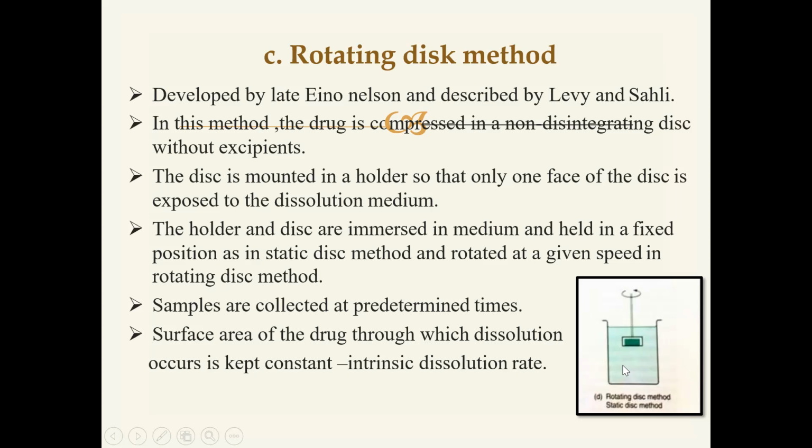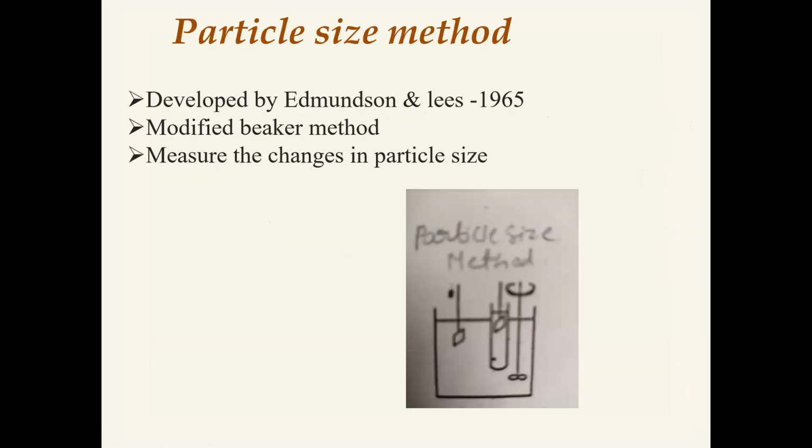Whatever tablet we place in the holder, we need to weigh before and after the assay. From that, after collection of sample and analysis, we will know how much drug is released. This is about the rotating disc method.